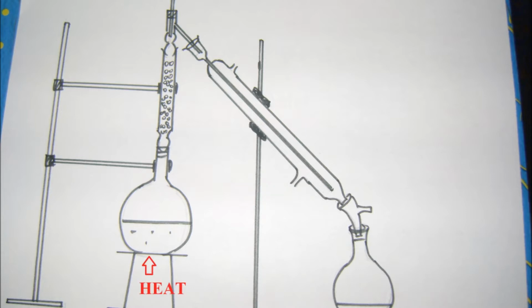Now let's review the steps. In the first step we have to apply heat to the round bottom flask containing the two liquids A and B, and since their boiling points are very similar, in the first case both A and B will form vapors, and the vapors of A and B will tend to move towards the mouth of the round bottom flask, towards the fractionating column.